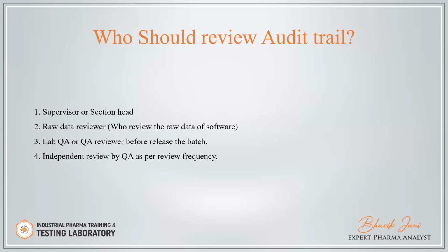Then lab QA or QA reviewer before release of the batch. Before release of any batch, QA review is required. Then independent review by the QA as per review frequency. Independent review by the QA as per the review frequency means whatever frequency we decide, daily, weekly, monthly, the QA is responsible for the review of the audit trail with that frequency.